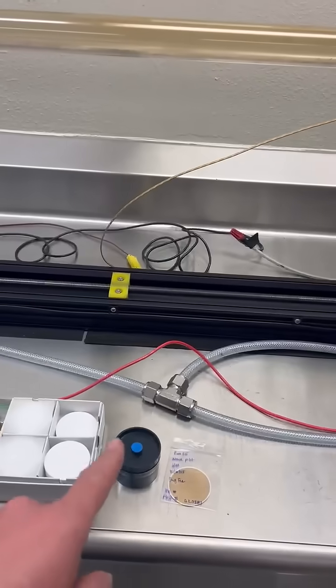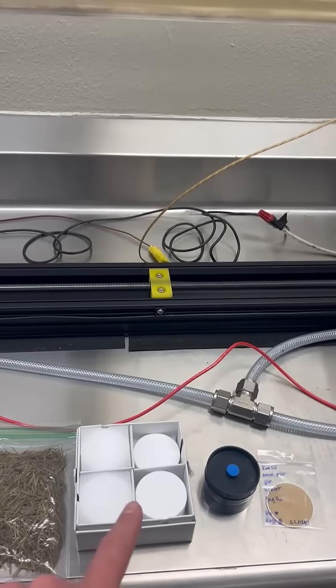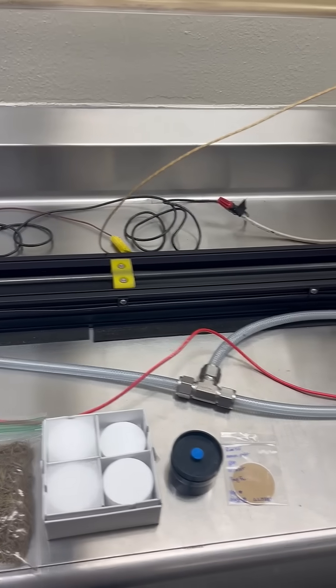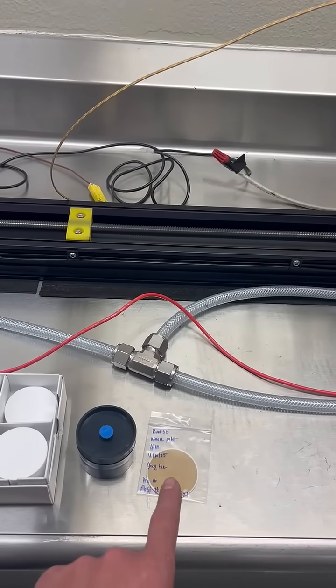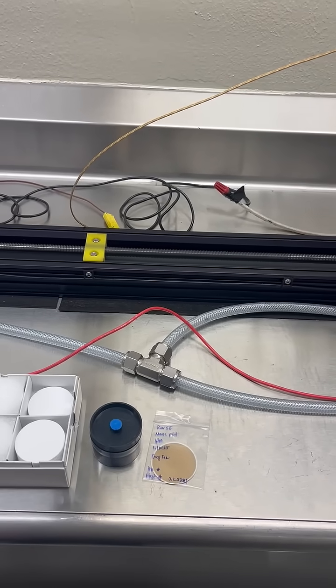Inside that cassette, which looks just like this, we add a pre-weight filter and at the end the filter looks like this, we do a post weight to understand how much smoke we actually produced.